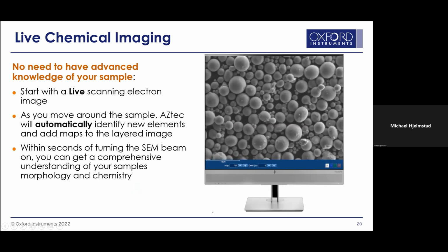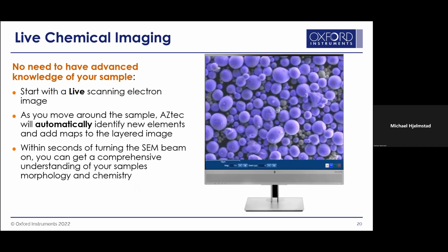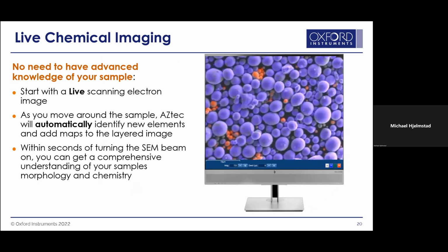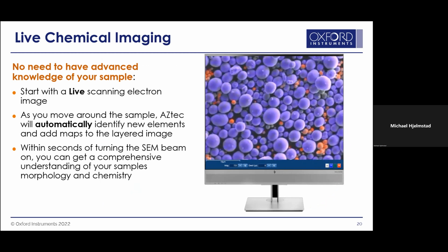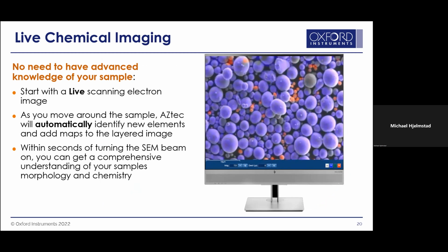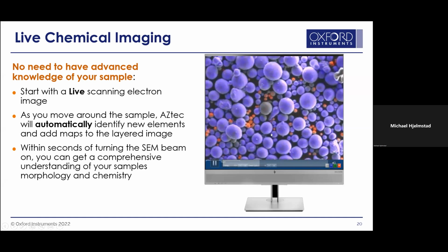It's looking at an additive manufacturing powder, and the expectation was that this is a titanium powder. But what we're looking around for is contamination. So we've turned the titanium on in blue. And then we've noticed that, gosh, all the particles show up and it looks like we have a tungsten signal. So we've turned the tungsten on red. And what we're really interested in is this gray one that just showed up.